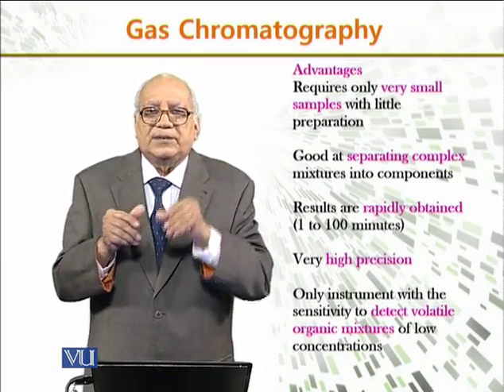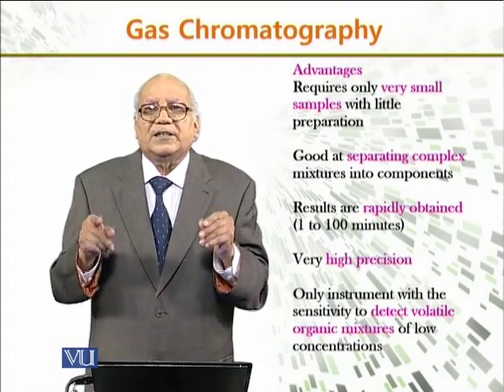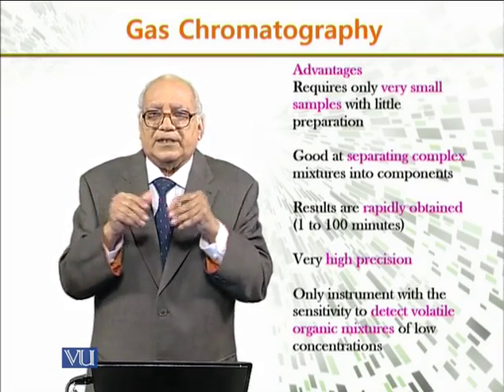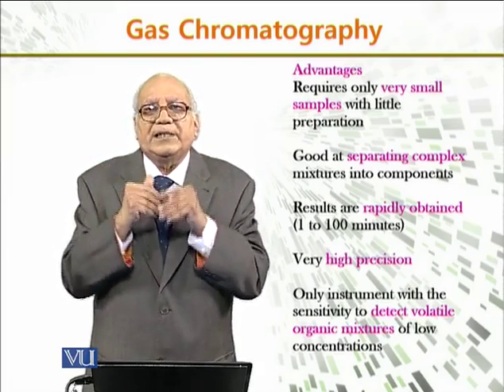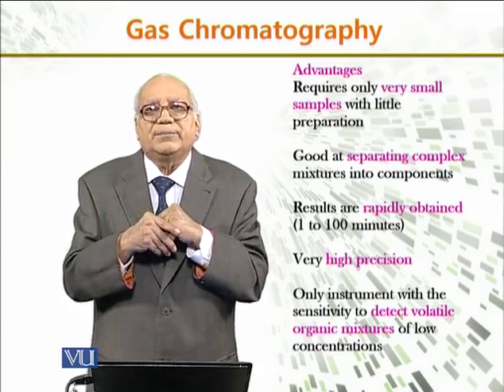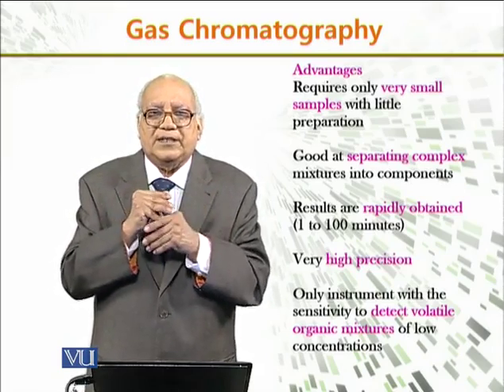Then it is good at separating complex mixtures into compounds. We can use it for separating the different compounds which are present in a mixture. Then the results are rapidly obtained in this case, and usually it takes within 1 to 100 minutes, that is, within almost 1.5 hours, we can use this technique.